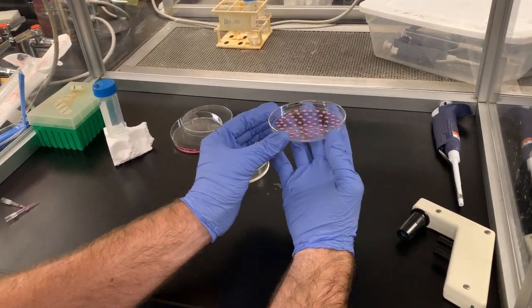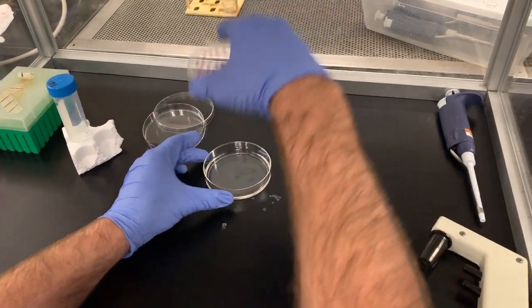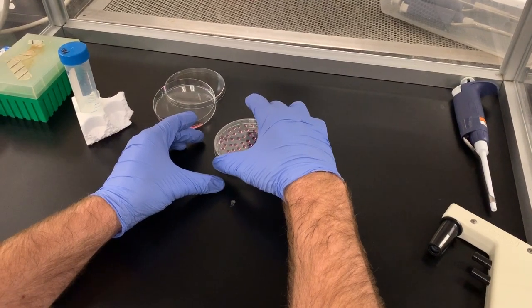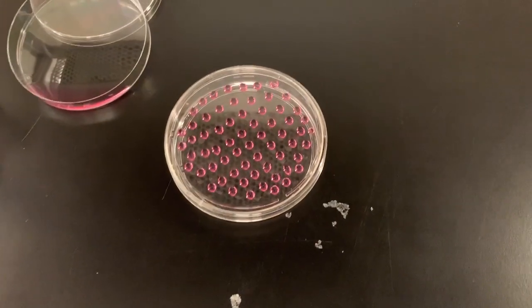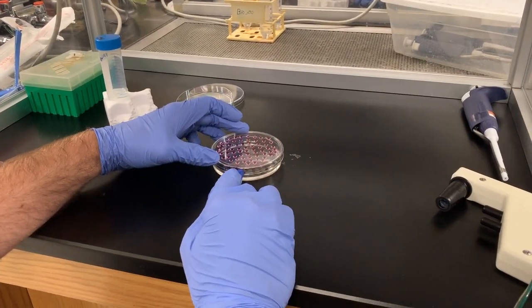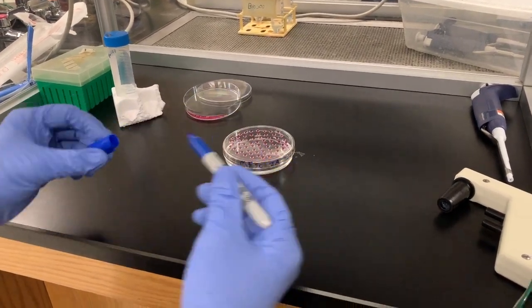The lid can now be turned right side up and placed carefully. The dish is then labeled and stored in a cell culture incubator for 3 days.